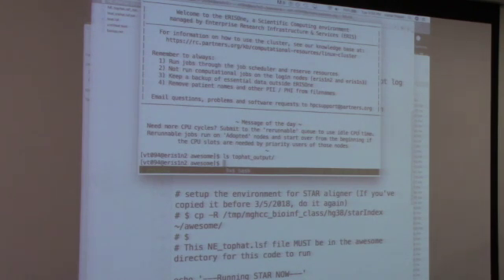So let's go into Awesome and change our, yeah. So we CD, oh yeah. Okay, so everybody, when we do the CD online number, I think right after loading the modules in your test.lsf, I ended up doing a CD. So delete that line and don't do a CD. And then you should be good if we try to rerun.